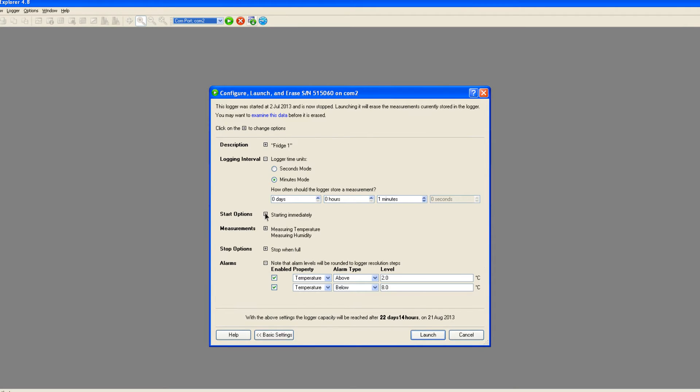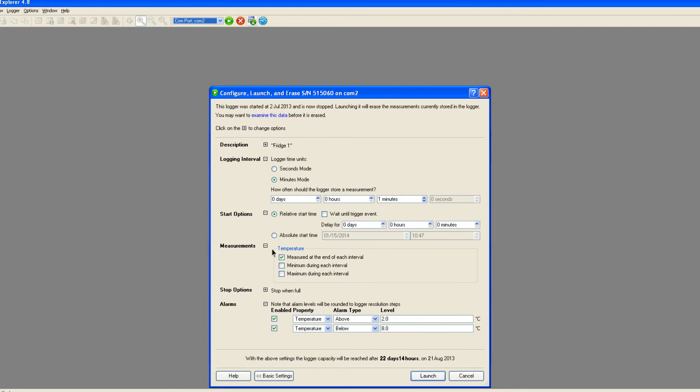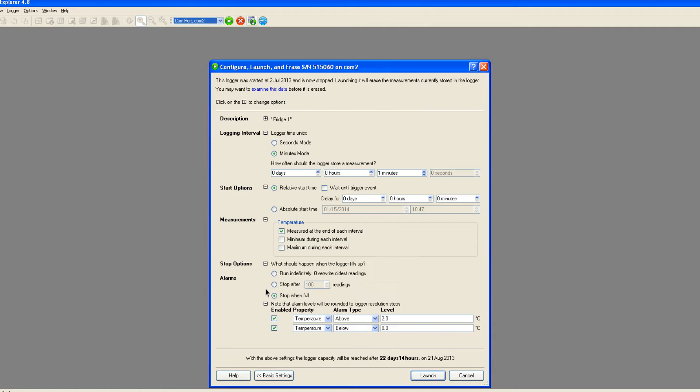Here you can delay the start of the recording until a specified time, record maximum and minimum readings during a logging period, select options for stopping recording, and set an alarm indication if readings fall outside a user-defined range.